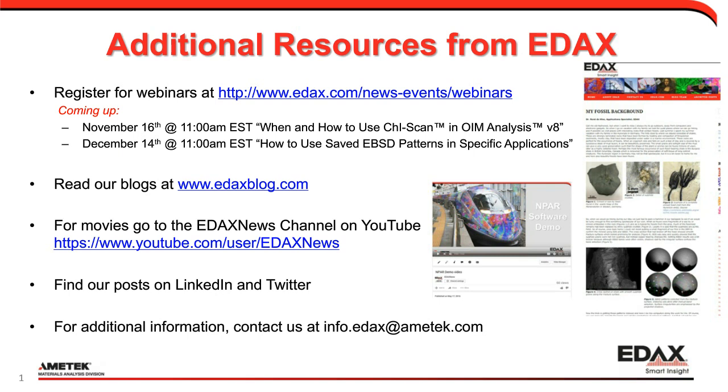Oh, yes, for increasing only the nitrogen counts of the hairy house spider, what are some of the tricks? One of the best tricks for low energy detection is to tilt the sample. A tilted sample reduces the exit path, or the mean free path, of the X-ray as it's escaping the material. You have to tilt towards the detector, but when you do, the X-ray travels less distance through the sample on its trajectory towards the detector.